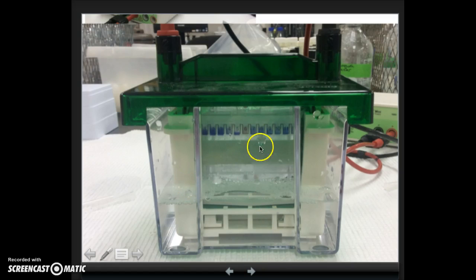Here is the gel loaded. You can see the blue sample buffer in each of the wells. That was loaded into this bigger chamber and we've added electrophoresis buffer around the outside. This will now make contact with the bottom of the gel. Then we attach the electrodes and you can start running the gel. It's going to pull the proteins through the gel from top to bottom.